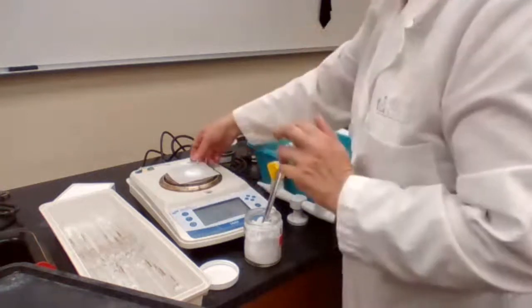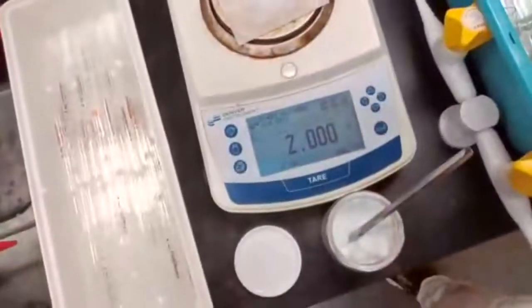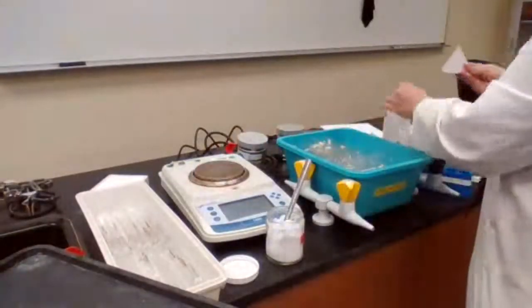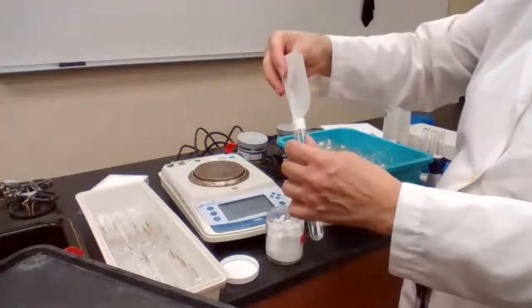Okay, 2 grams. So now you see that's 2 grams for test tube number 1. I make a funnel with the paper, and I place it in test tube number 1.